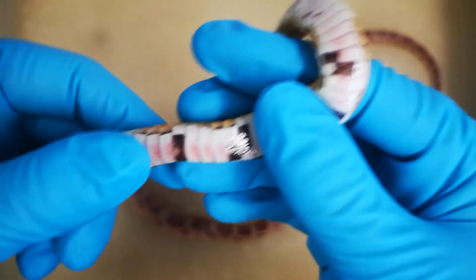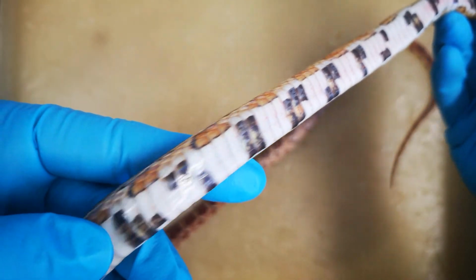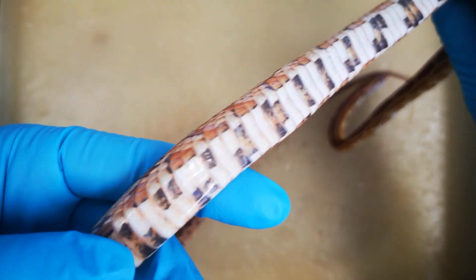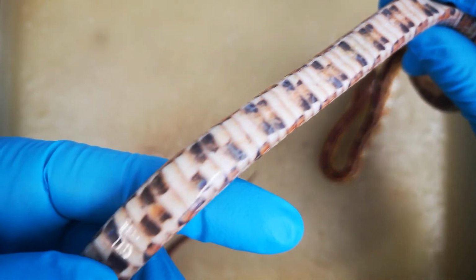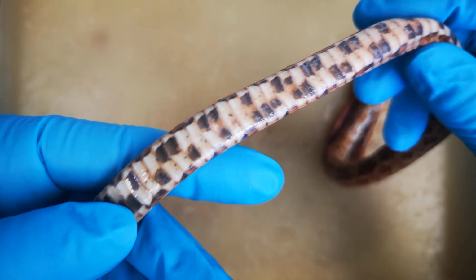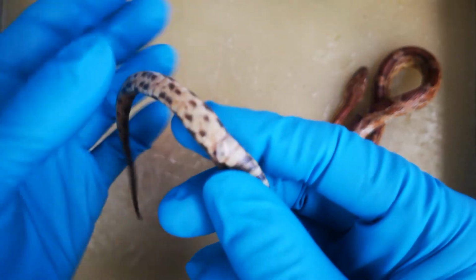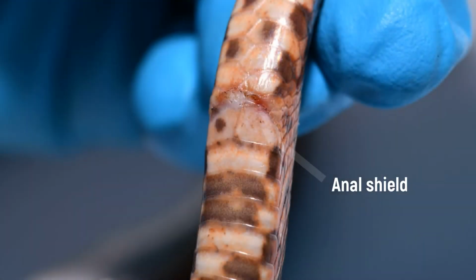Most snakes have a single broad row of ventral scales. In contrast, the underside of the tail has either divided or undivided scales. The cloaca can be identified by a larger flap-like scale. In some species, like Pantherophis guttatus, it is divided. This marks the end of the body and the start of the tail.